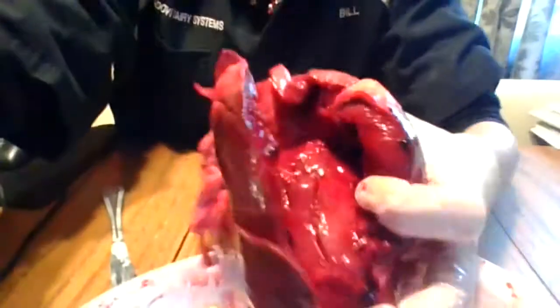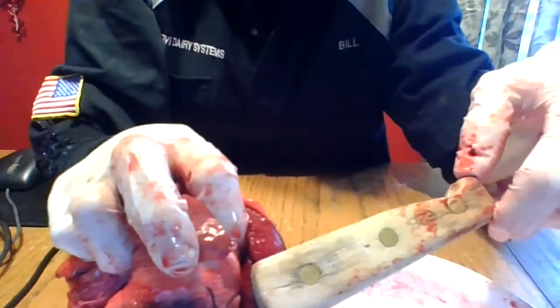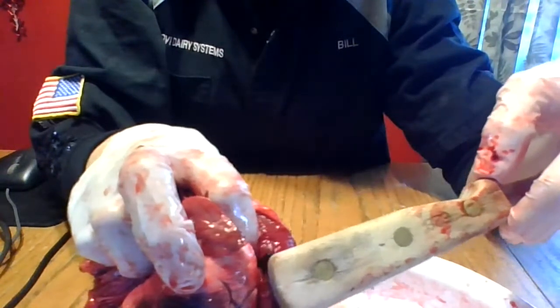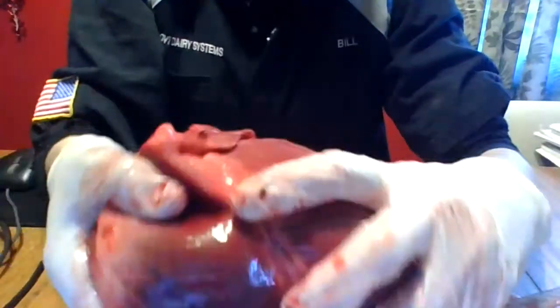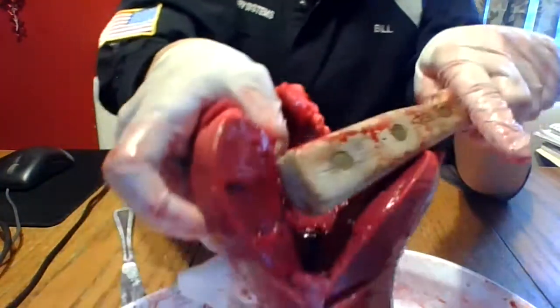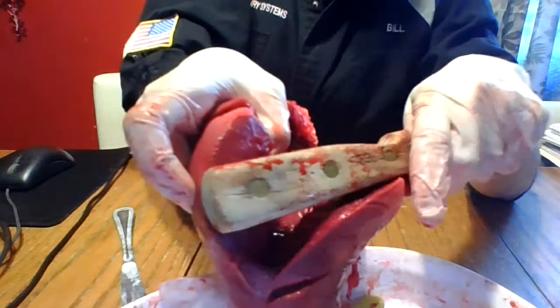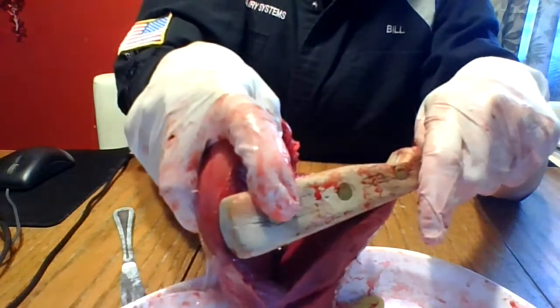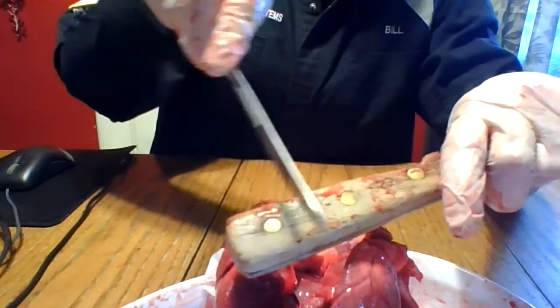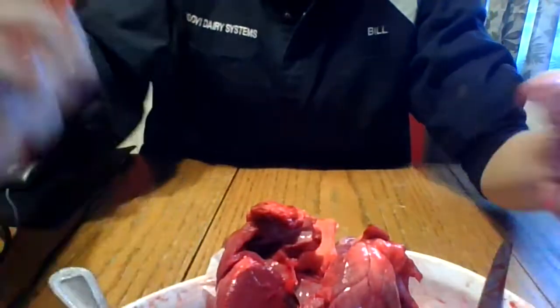The most interesting thing is the thickness of the right ventricle versus the left ventricle. See how thick that is? I'm using this as a measuring device. That's the thickness of the right ventricle, which pumps blood to the lungs. Now look at the thickness of the left ventricle — see that? It's past the circle, while the right ventricle only went this far. The left ventricle is so much thicker — it's crazy.